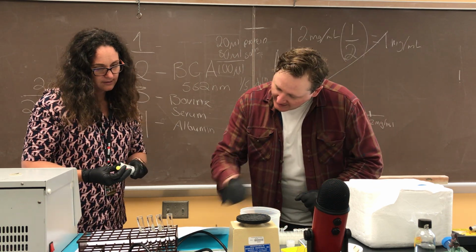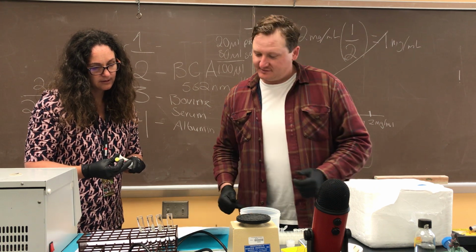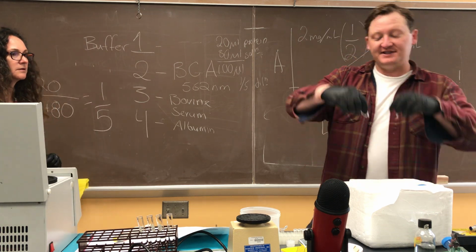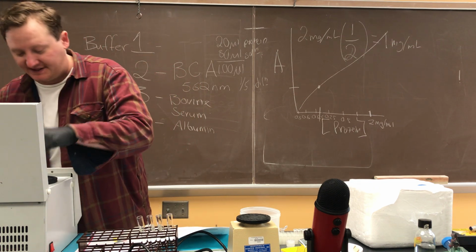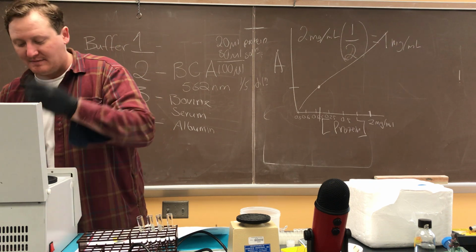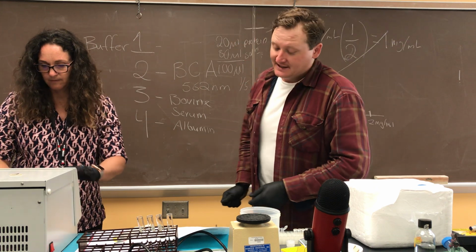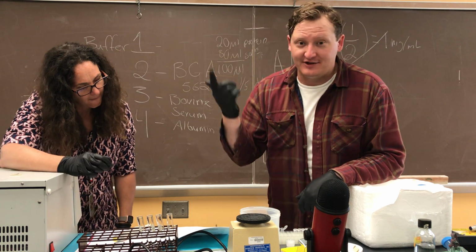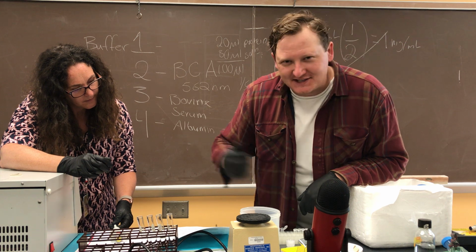Okay, so now we just need to centrifuge at full speed for 5 minutes. Cool. So what's happened here now is the cells have been put into the solution with the buffers. So the buffers are all acting as described earlier. The detergents are breaking down membranes. The hypertonic solution should be bursting, the hypotonic solution should be bursting these cells. And now we want to actually take all the cellular debris from the broken open cells, and we want to pull that out. So that's what's going to happen here.